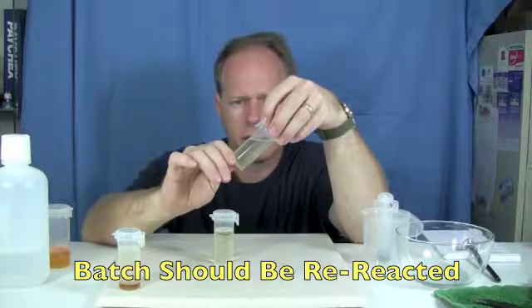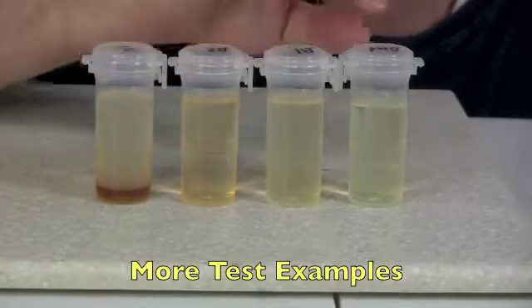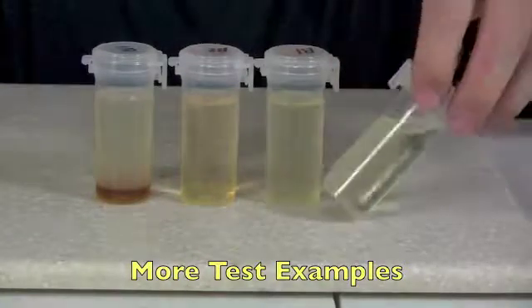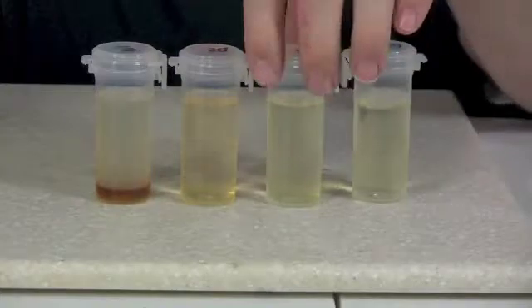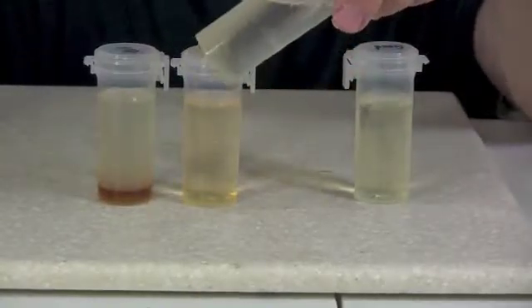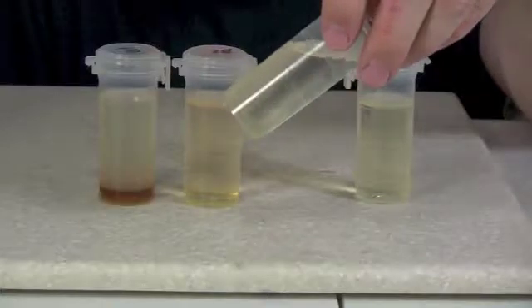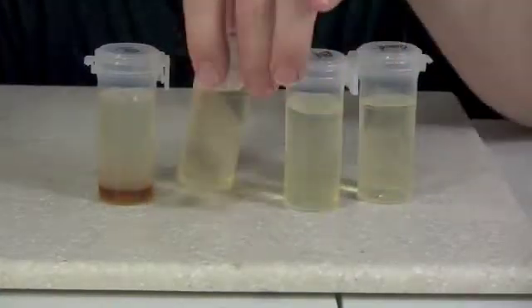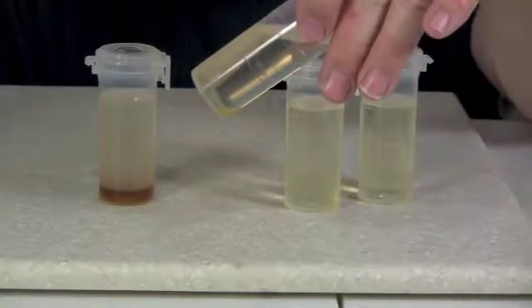So this batch I would re-react. This is a really good example of fuel that is completely passing this test — there's absolutely no fallout. This batch almost passed, but there's just a sliver on the bottom. This one has a little bit more puddling — I would call that maybe a quarter of an inch.